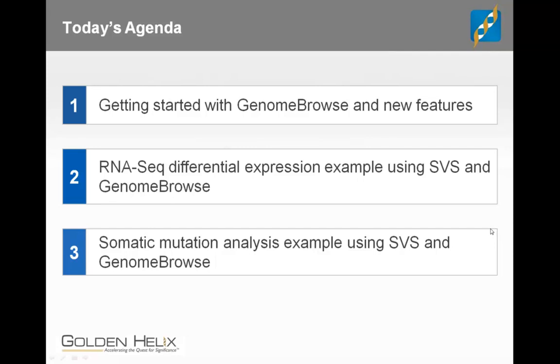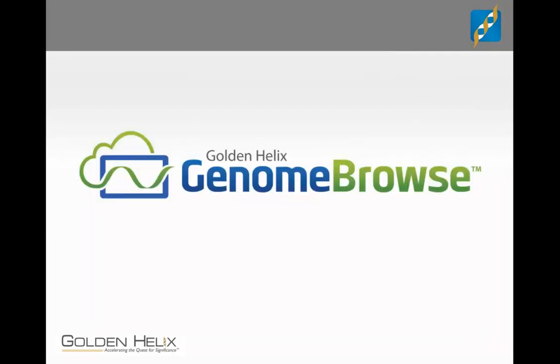I'll start by walking through Genome Browse, highlighting the experience from the perspective of a new user, while pointing out new features that have recently been added. Major additions since the original release include support for directly viewing VCF files and BED files, as well as a useful tool for generating a table of data based on the genomic data visible in the visualization. From there, we'll show two examples of SVS and Genome Browse working together — first an RNA-seq analysis project, then a DNA sequencing project based on somatic mutation analysis from a gastric cancer sample.